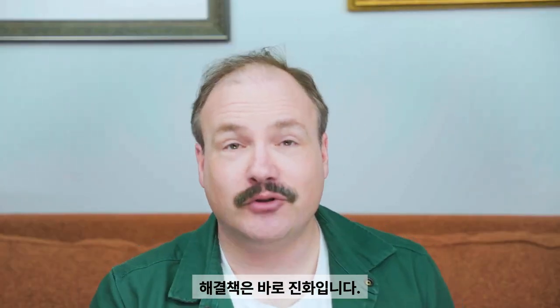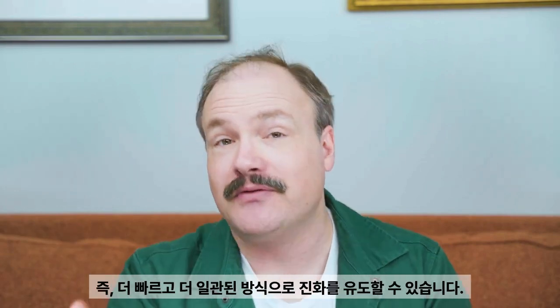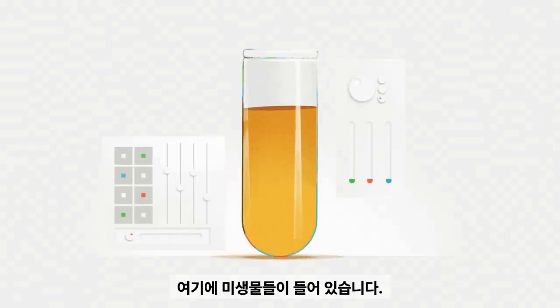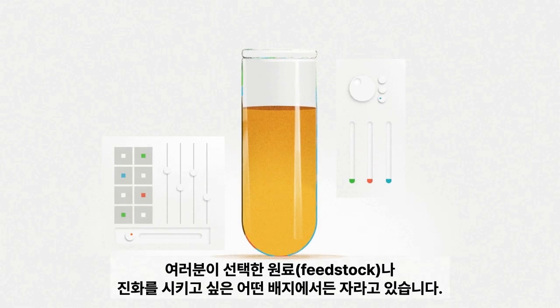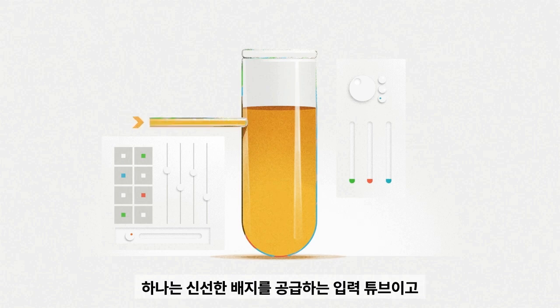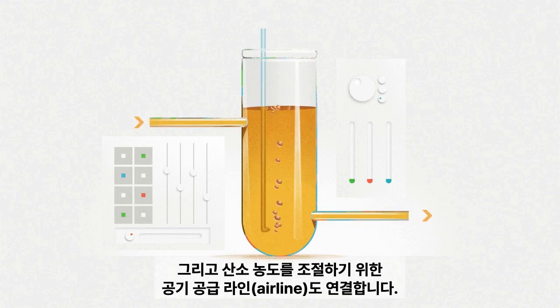Evolution is the solution. Our automated ALE system allows evolution to happen under ideal conditions. That means faster and more consistently. Here's how it works. We start with a microbial culture. These are your microbes growing in your feedstock or whatever growth media you want to evolve them in. We hook up some tubes. There's an input tube to supply fresh media. There's an output tube to take away waste. There's an airline to control the oxygen levels.